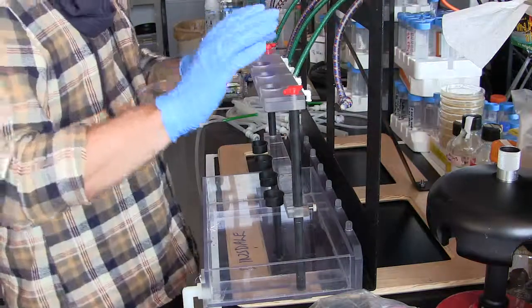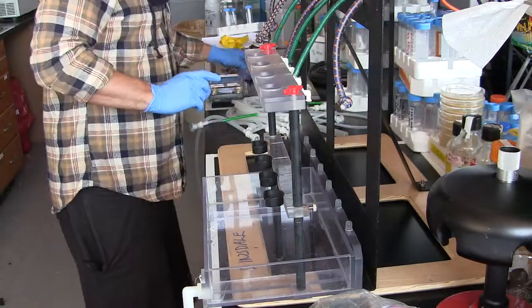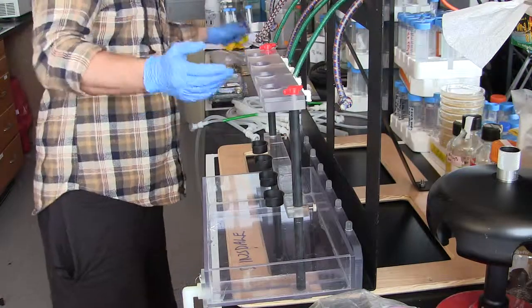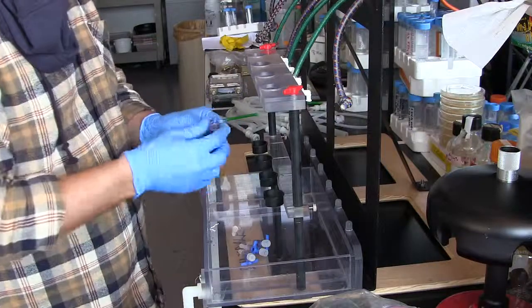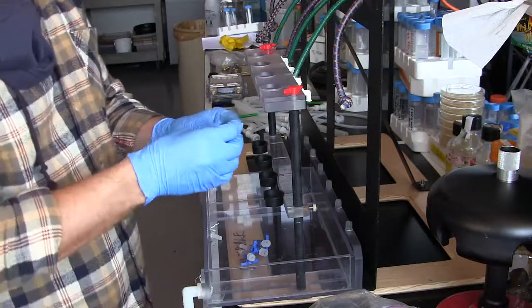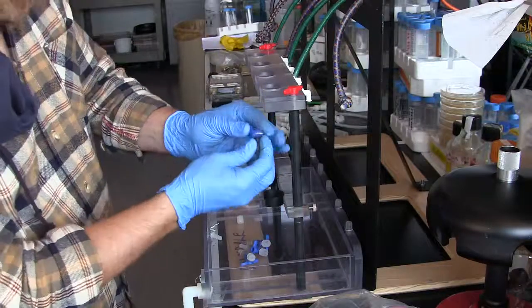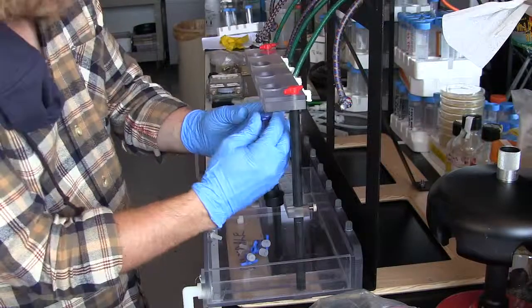Okay, so let's assume that I've built both of those. We'll start working on just one side here. Next, what you want to do is put the fittings onto this piece here. Fittings are these 4 spigots, which have luer lock at the top and bottom, female and male. What you do is you place this into this female luer lock and twist it around.